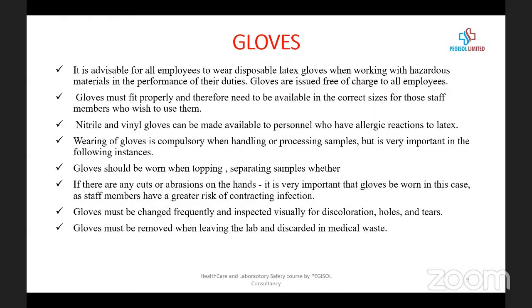So if there are any cuts or abrasions on the hand, it is very important that gloves be worn, as staff members have a greater risk of contracting infections. Please note that gloves should be worn when topping, separating samples, or whether you're topping samples, you are separating samples, gloves must be worn.